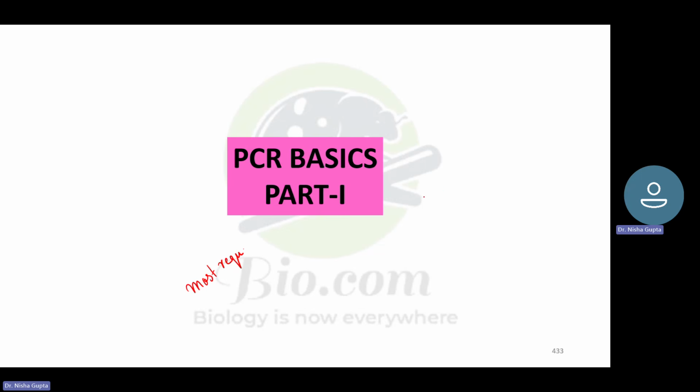Now this will be a series related to PCR, as without the PCR invention, the biomedical research field would probably have collapsed, right? Because if we talk about the confirmed diagnostic part, without PCR, without the molecular diagnostic part, we cannot do so. So this will be the first part where I will be providing you the basic information about PCR, and then I will be providing part 2, in which I will further discuss the components involved in the PCR reaction.